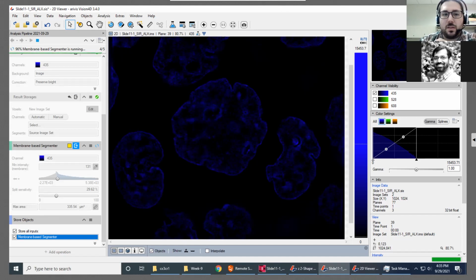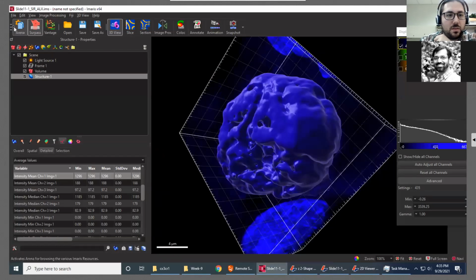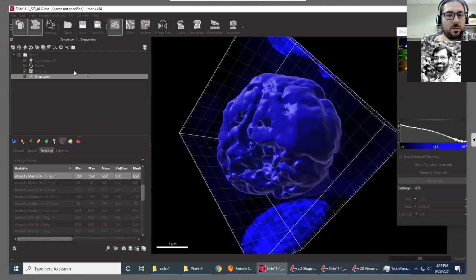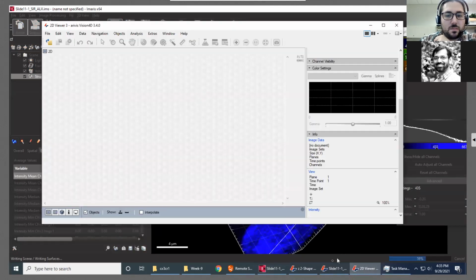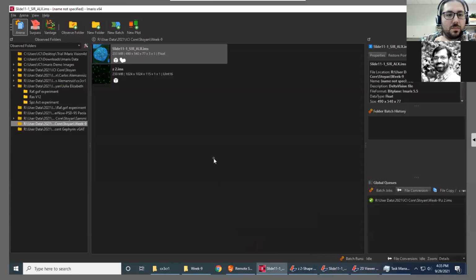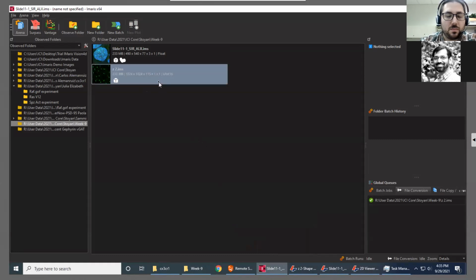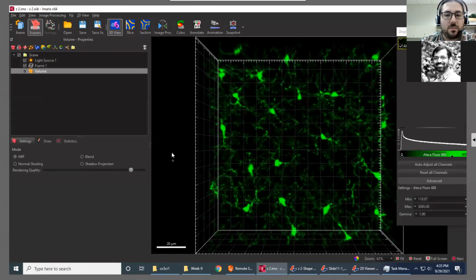Okay, let's let it finish. And while it's trying to finish, I want to bring up something right where you were in Imaris, which is it's good for users to import their data from cloud drive and store it on the data drive of the computer and then use Imaris versus trying to work directly from the cloud drive, because that's going to all depend on the connection, and it slows down the processing. So if you want to highlight that part while you're in Imaris.